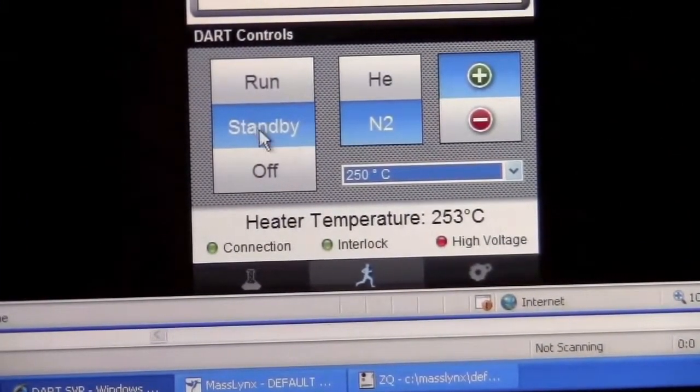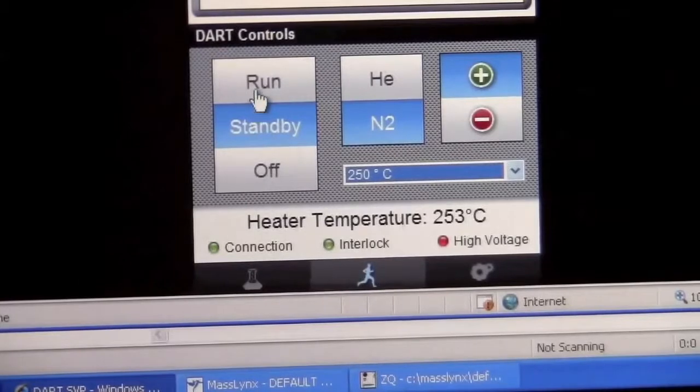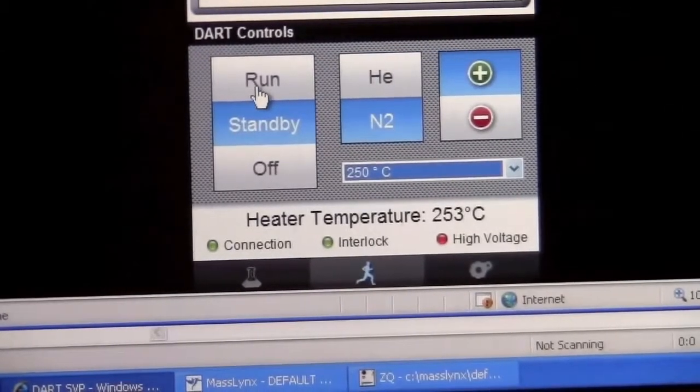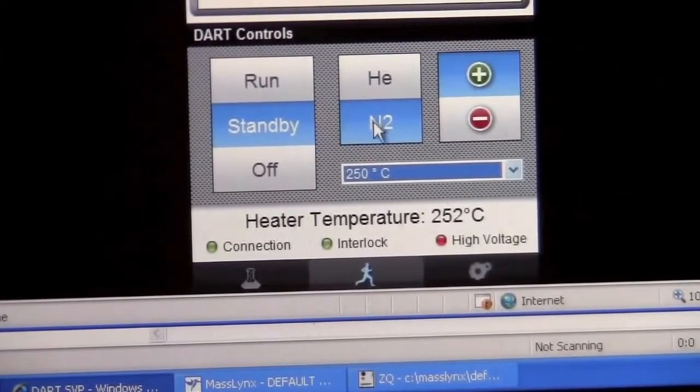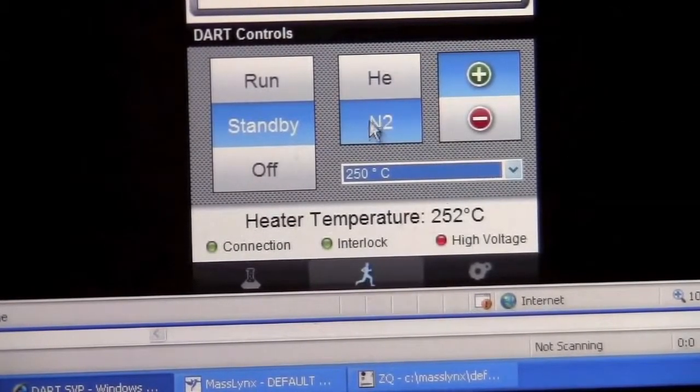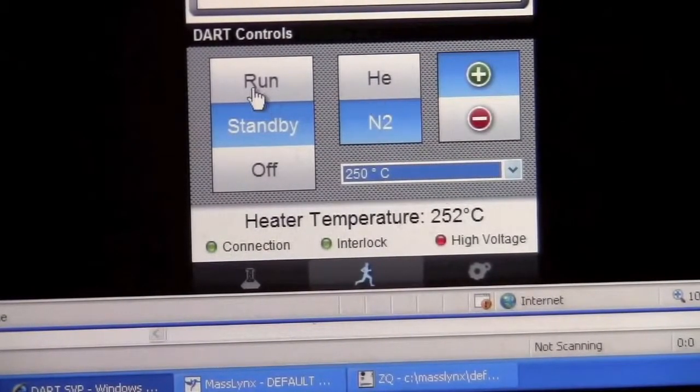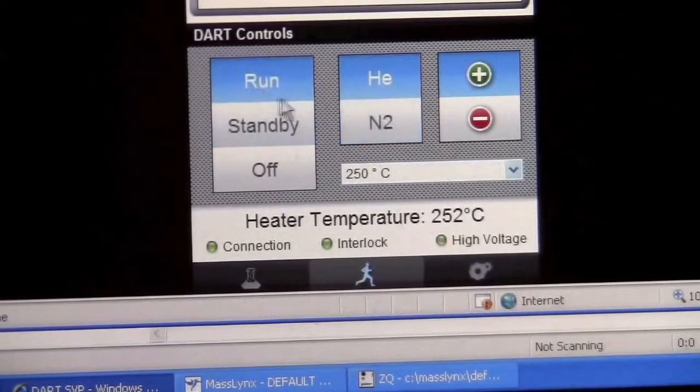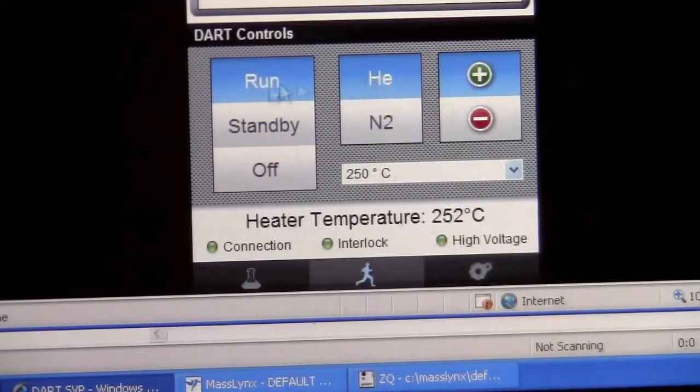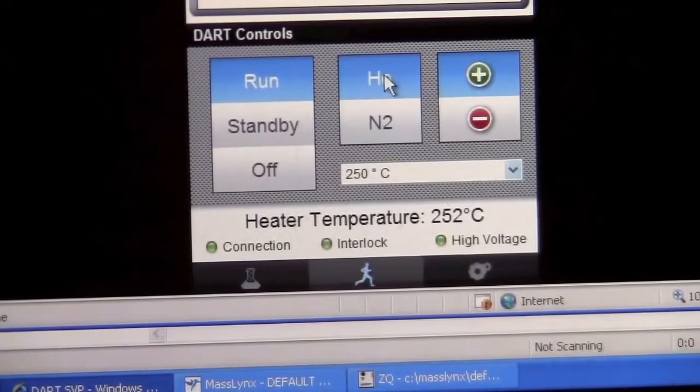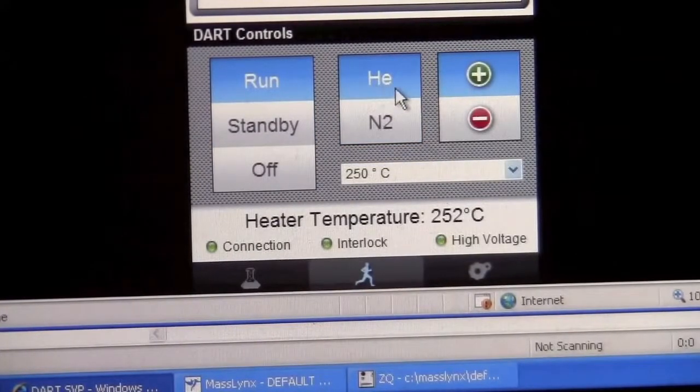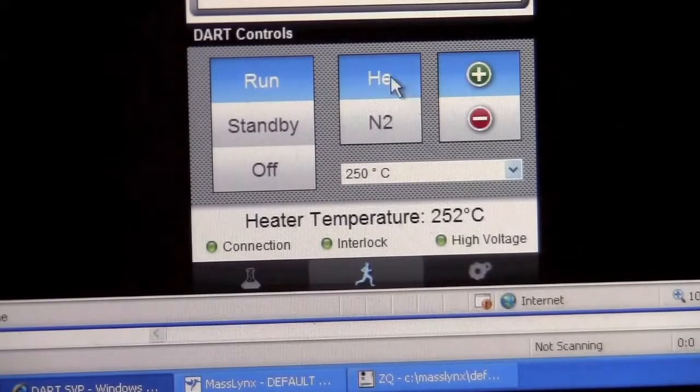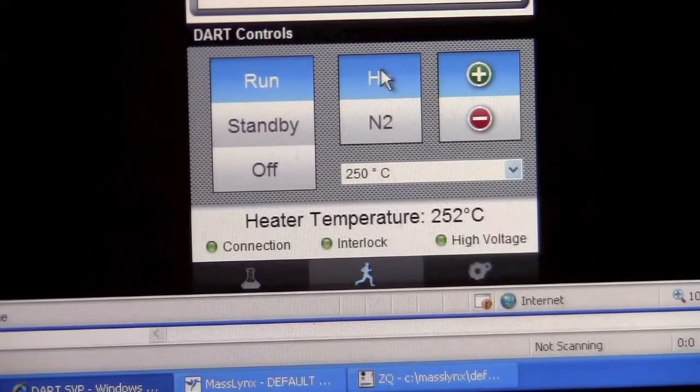We can switch the mode into run. When I switch it into run, it's going to change the gas from nitrogen to helium. We only want to leave it in run mode for a limited amount of time because it uses helium and we do not want to use too much helium.